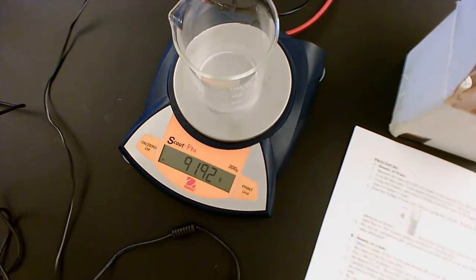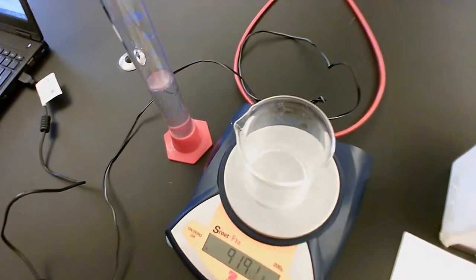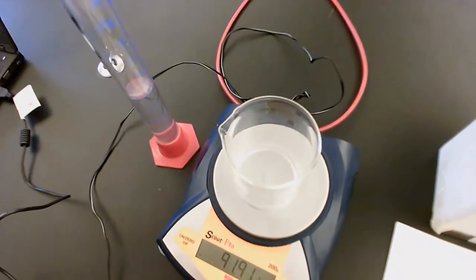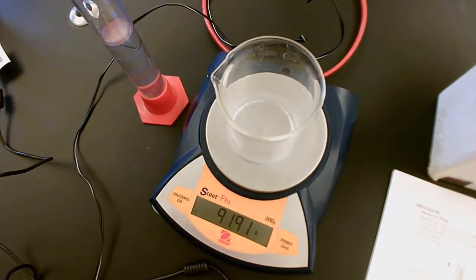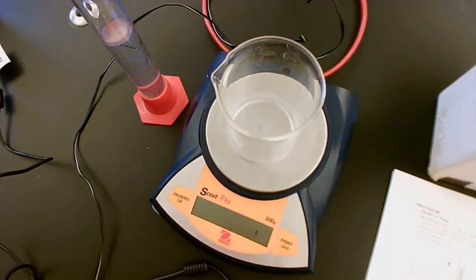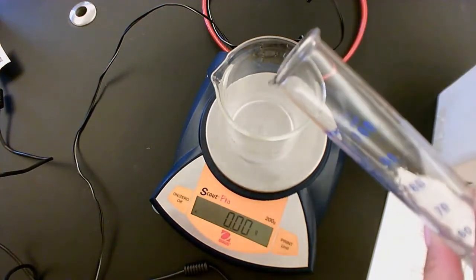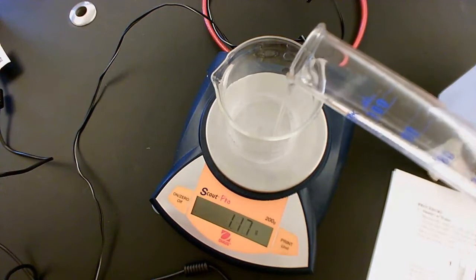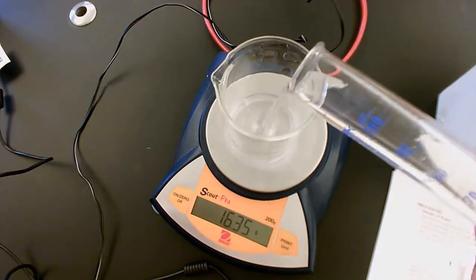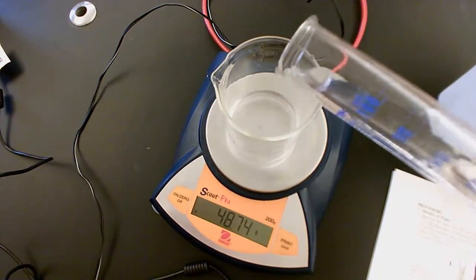So I have a graduated cylinder with water, and I'm going to tare the balance. Tare the balance means this button right here, the 0 button. So now my balance is recording 0, so now I can add my 50 grams of water. I'm slowly adding it. Now I'm close.